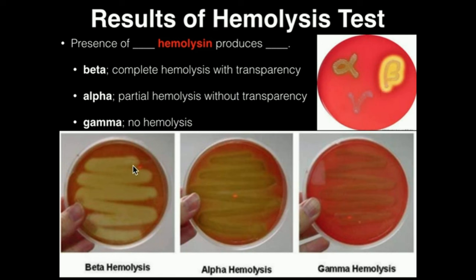Here's another look at beta hemolysis — it's definitely the brightest when you hold it up to a light, and that's how you recognize beta hemolysis. If we have alpha hemolysis, there will be a zone of change around the bacteria, around the colonies, but we don't have transparency. You can see the dark regions where the bacteria were smeared, and we see a little bit of change around that, but it's definitely not transparent. It's much easier to see whenever we hold it up to a light in the actual lab.